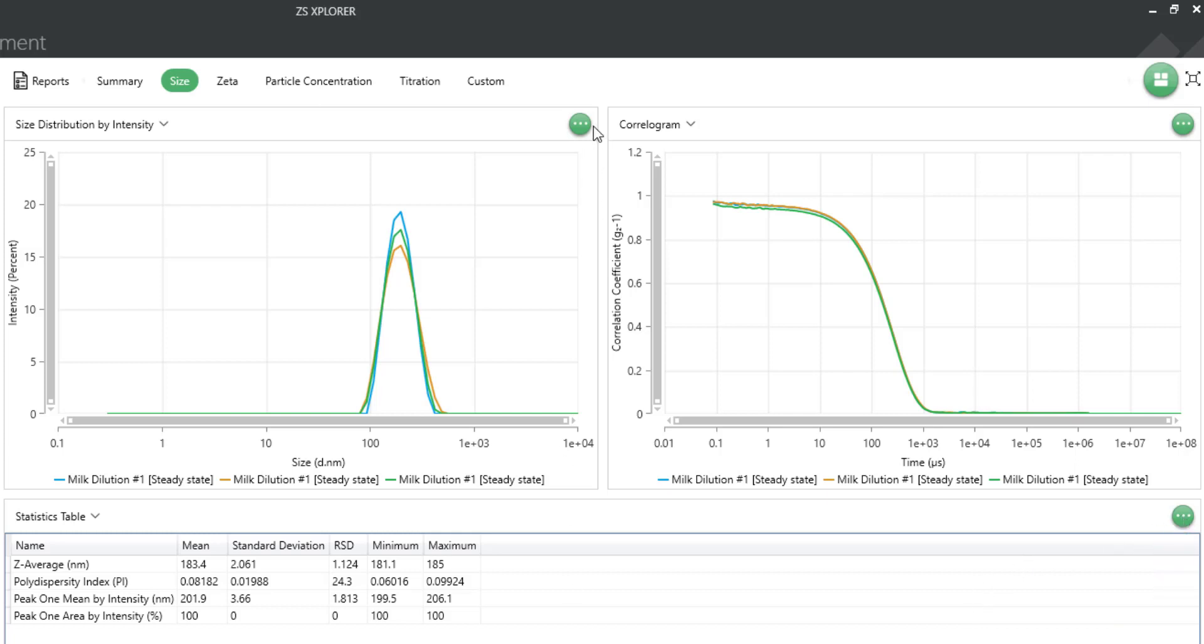Another option is to copy data. This places a copy of the data from the graph onto your clipboard that you can paste directly into Excel or other programs to re-plot.